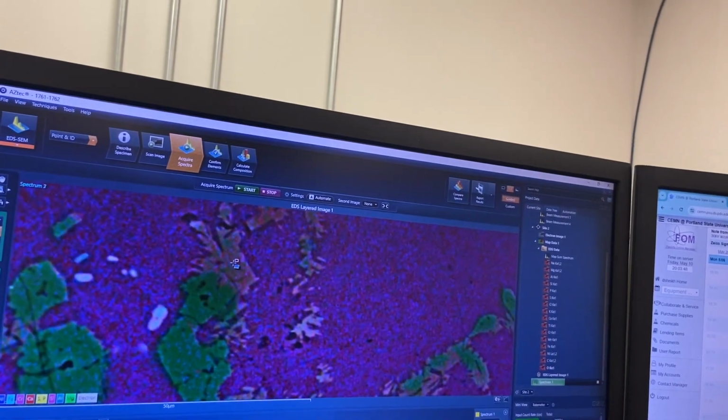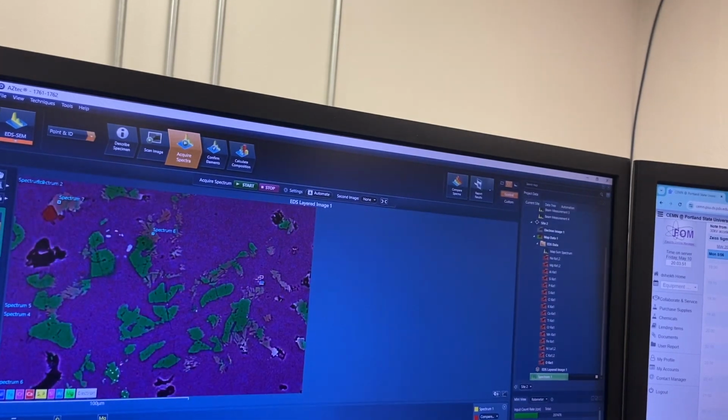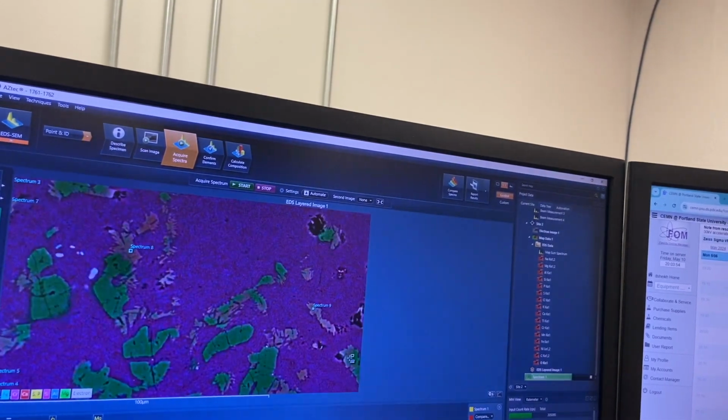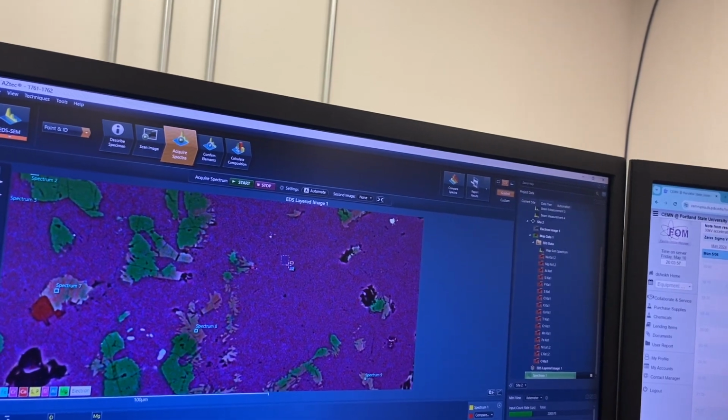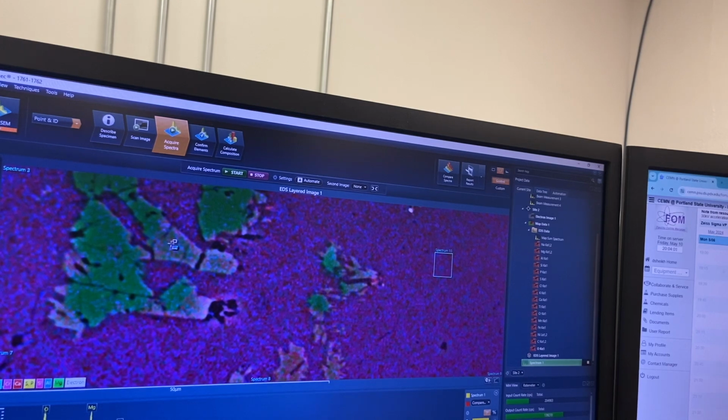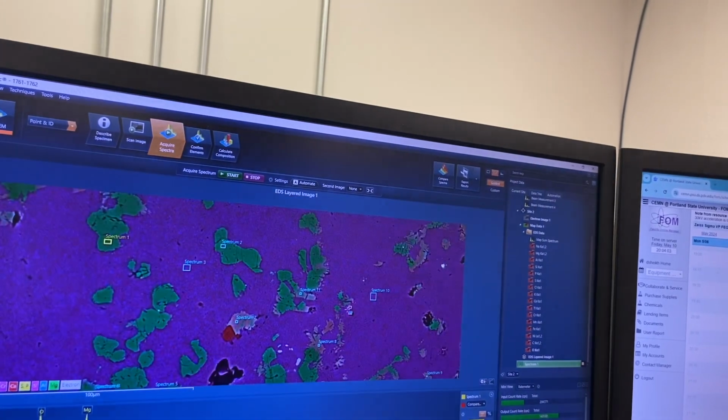Let's try that. Some more magnesium here. So zoned pyroxene for sure, which does support rapid crystallization from a melt. I imagine you form the olivines first, and then you probably form pyroxene later. So maybe the olivine was the liquidus phase.